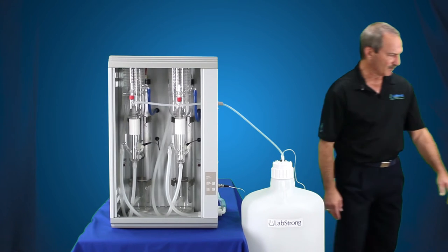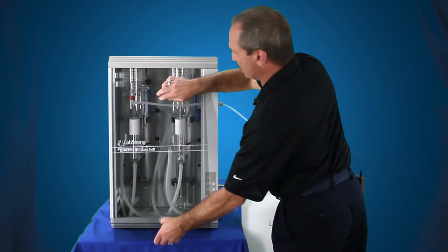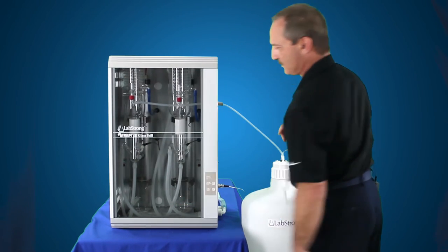Last but not least, we want to put the door back in place, because anytime you operate the still you want to make sure the door is in place. Simply take the door, slide it up into the top slot, down into the bottom slot — door's in place.